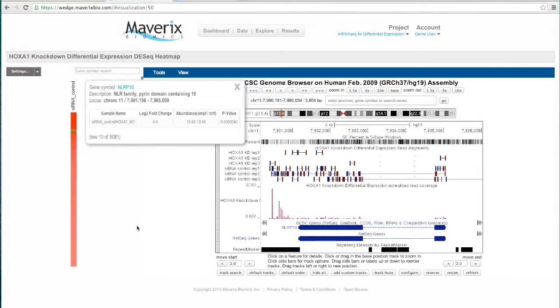So this is integrated together so that the data set that's being used to display this heat map is actually what's driving the integrated genome browser on the right-hand side. As you mouse over any of these rows within this heat map, you'll see a tooltip will pop up that has the sample name, and in this case what it'll show you is what sample you have versus what the reference sample is, or control, depending upon how you have this configured. You'll be able to see the log2 fold change. You can look at the abundance values, and you can also see the p-value for this sample.